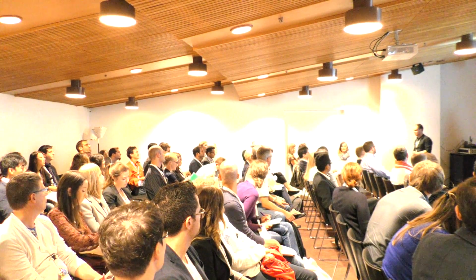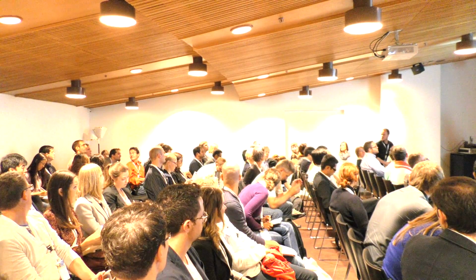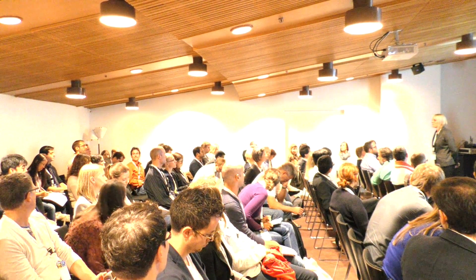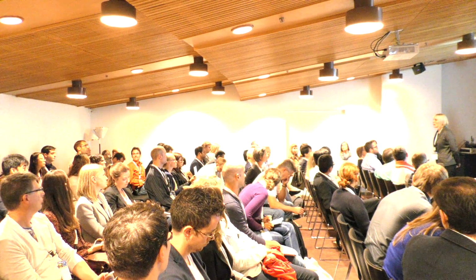Just a question related to the two platforms you mentioned, suspension and adherent, for the upstream. Does it have an impact on your downstream, and what kind? It can have, it always has. Even tiny little changes you do in upstream have an influence on the downstream. I actually like your question. In adherent systems, we typically have FBS, which is a huge issue that needs to be removed for the downstream.